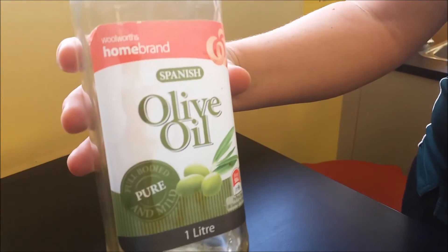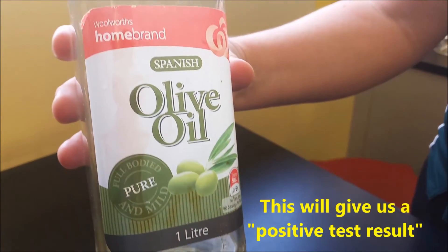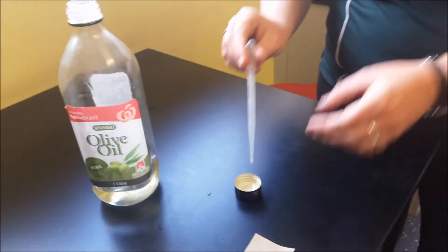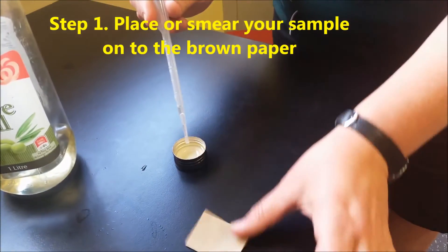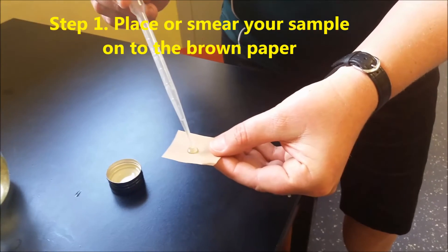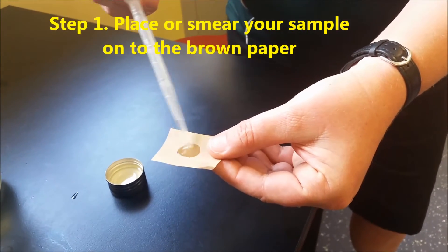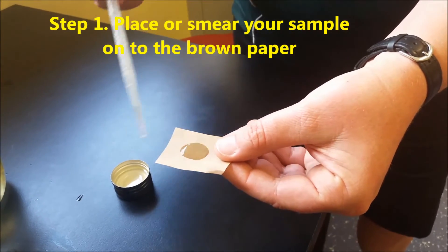The fat that we are going to use is olive oil because we know that that is a type of fat. We are going to put just a little bit of fat onto the brown paper. I am just smearing it in.